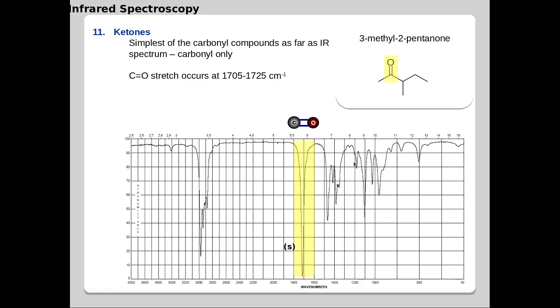Then this part of the bands are due to the carbon-carbon vibrations between the carbonyl carbon and the sp3 carbons here.